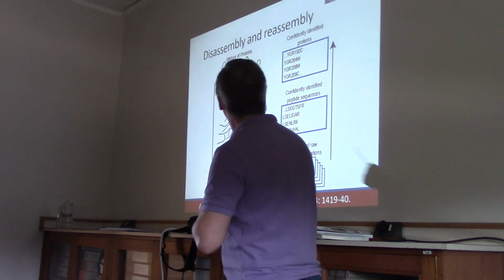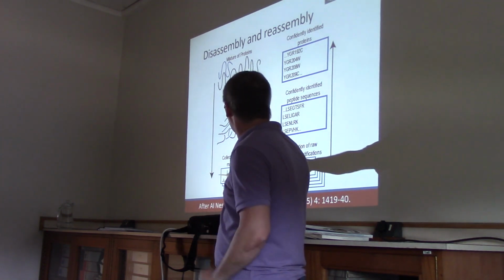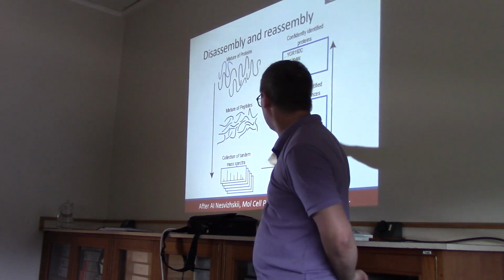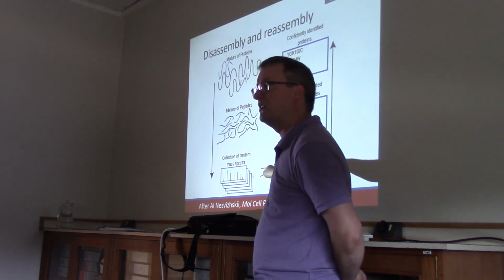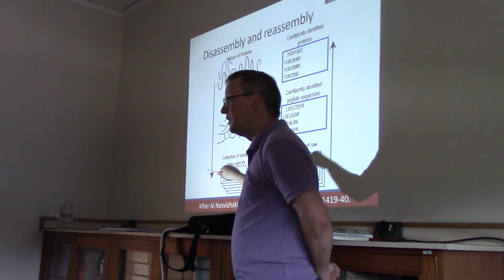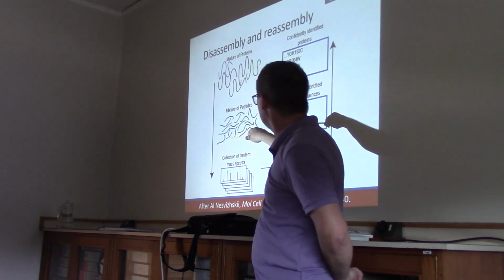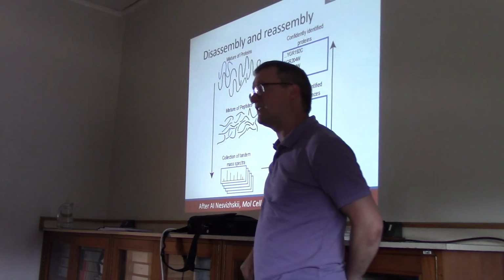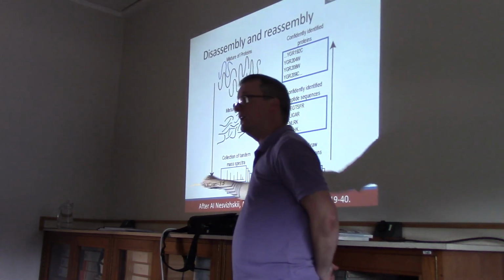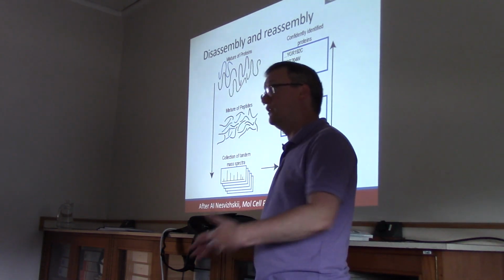Right. So, I'm going to try to contextualize how this whole pipeline fits together. The process of starting with a collection of tandem mass spectra and coming up with a set of raw peptide identifications, creating peptide-spectrum matches, is the process for the database search engine. We are also going to talk about how we discern which peptides we actually want to keep from a collection, and how we infer a set of proteins from that. But most of this lecture is about this step right here. Given a bunch of tandem mass spectra, how do you discern what peptides you would claim those spectra represent?